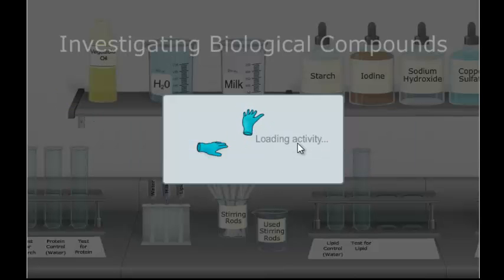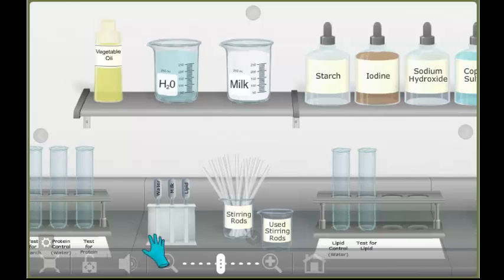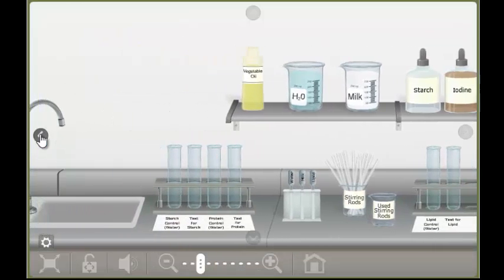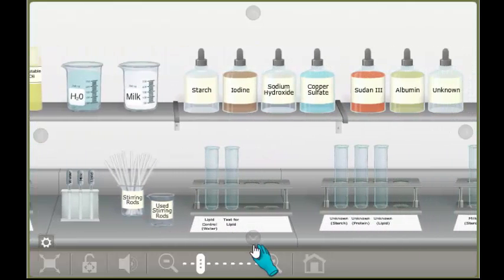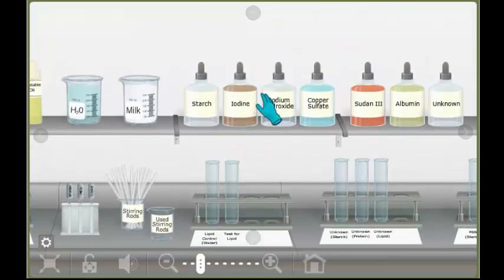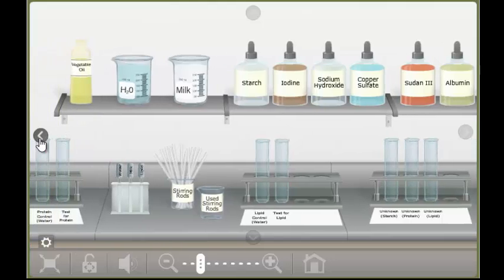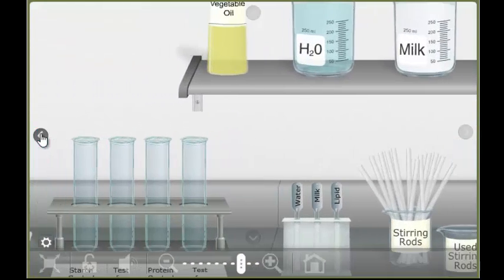I happen to like blue. It will take just a minute to load, and then you'll be able to start your lab. I'd recommend you zoom out a little bit because what you'll have to do is pan back and forth using these gray arrows to move from left to right. You can also tilt the screen up or down, which I don't think is really very necessary once you get it centered.